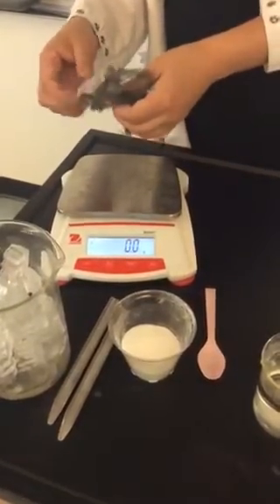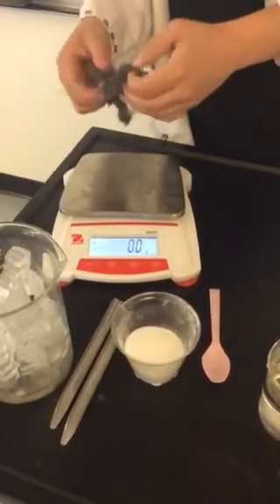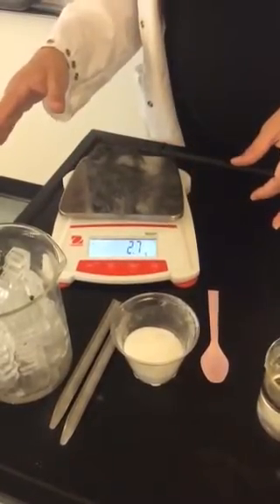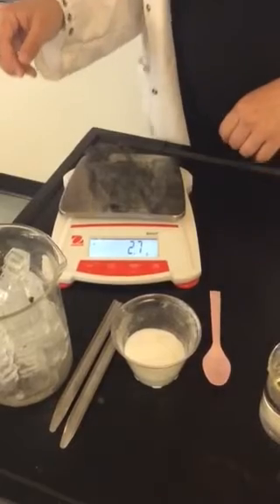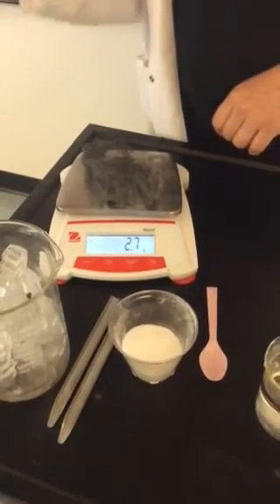What do you think will have happened? Will the mass go down? Will the mass go up? Or will the mass stay the same? Placing the same steel wool back on the scale. We have a mass of 2.7 grams.